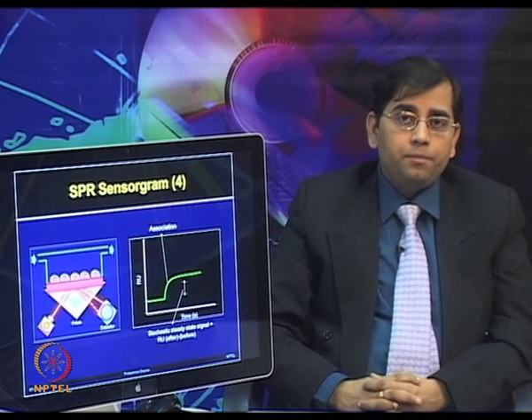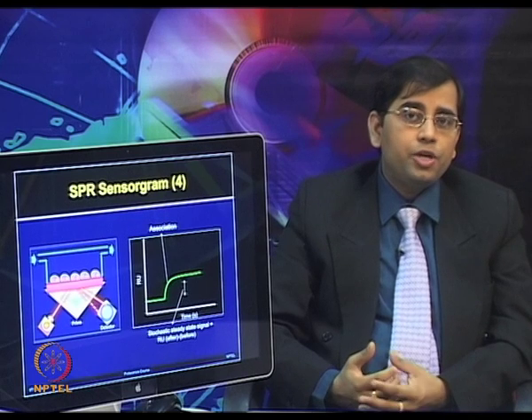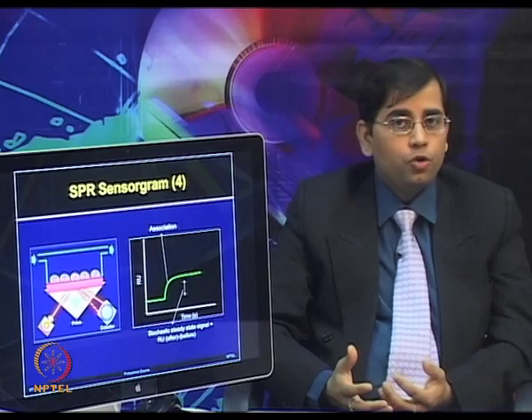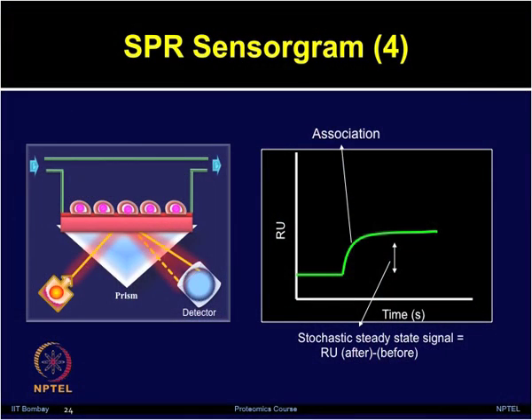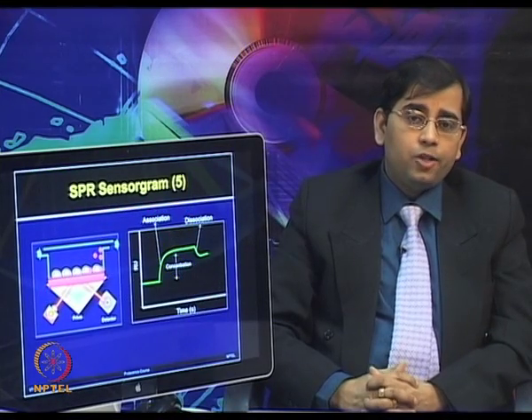Now, after some time, when the binding is reaching a saturation level, almost all the query molecules have occupied binding with the proteins immobilized on the chip. Then they reach a state known as steady state, which is representative of response unit signal after and before.